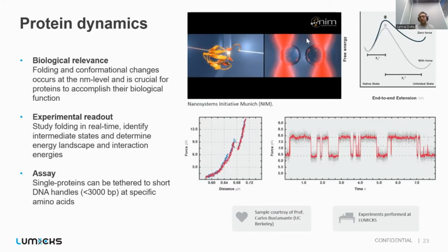So it could have multiple biological implications, for example, in drug design. The way a protein folding assay is done in a C-trap is that two beads are taken, and the protein molecule is tethered between these two beads using a stiff DNA handle, and then the beads are pulled away from each other, which generates a force extension curve, as we can see here. This is the worm-like chain behavior, and at this point the protein unfolds, and then when it is relaxed, the protein folds back again.